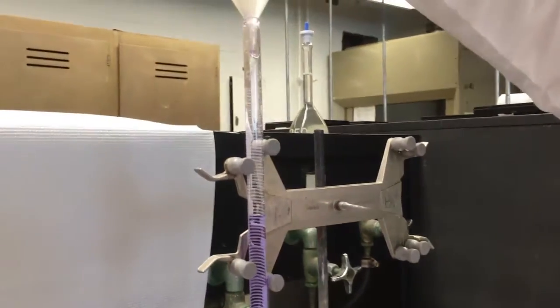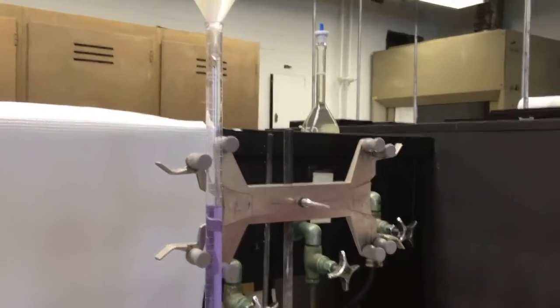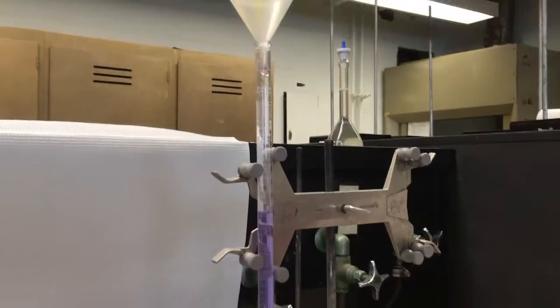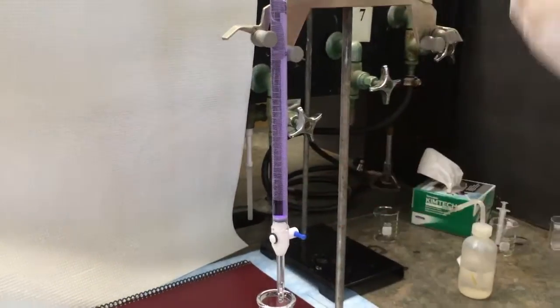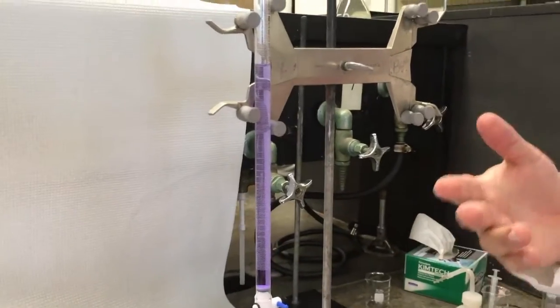Alright, now a lot of students always feel they have to load the solution all the way to the very top, to the 0.00 line. You don't have to do that. Anywhere that you can read it is fine. You have to have the liquid level below the zero there and above the bottom line here at 25. If it's outside that range, you can't measure the volume in delivering. Otherwise, you can use it at any level you want.